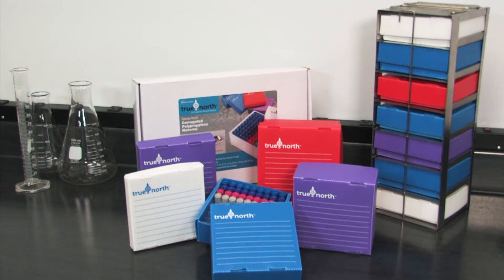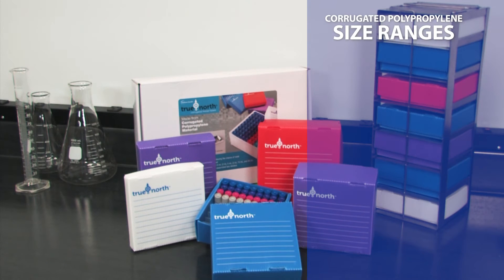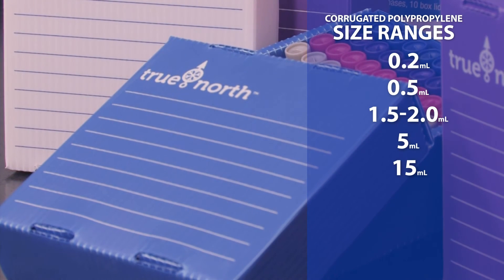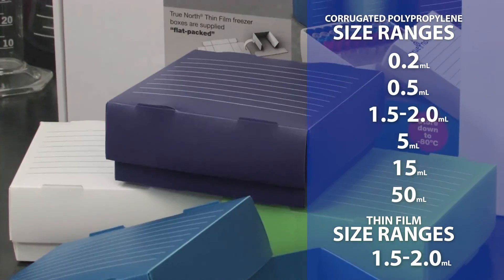True North freezer boxes come complete in packs of 10, with multiple sizes and colors available. Corrugated polypropylene size ranges: 0.2, 0.5, 1.5 to 2.0, 5, 15, and 50 milliliters. Thin film size ranges: 1.5 to 2 milliliters.